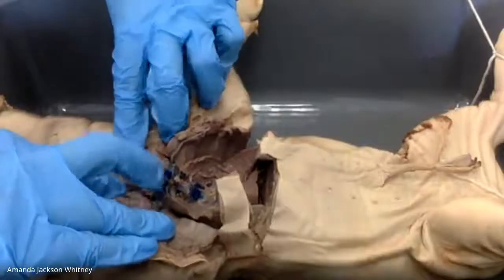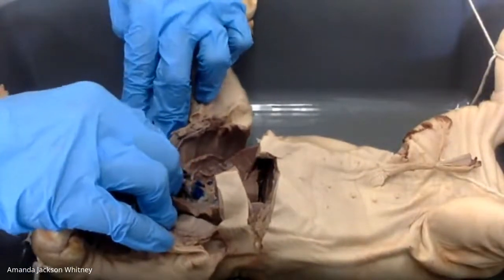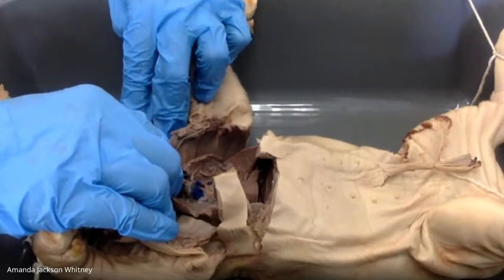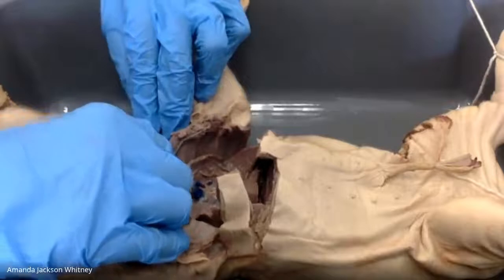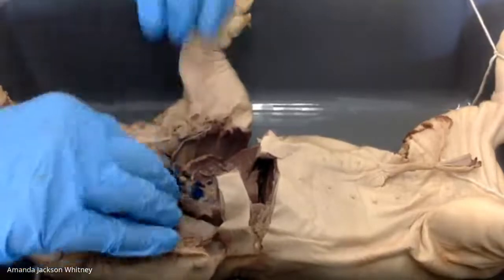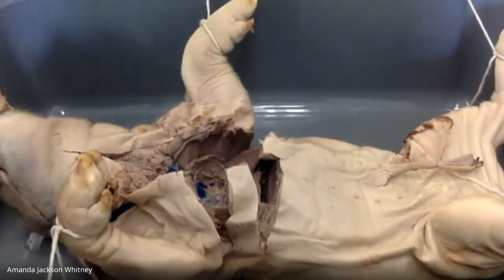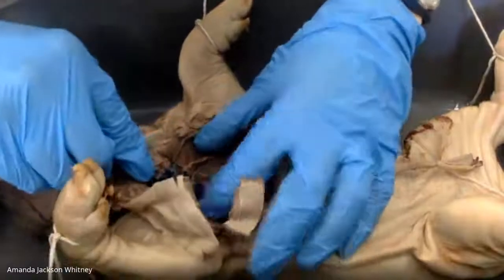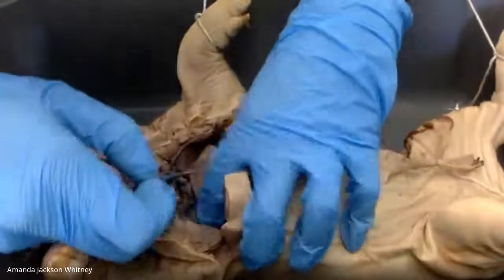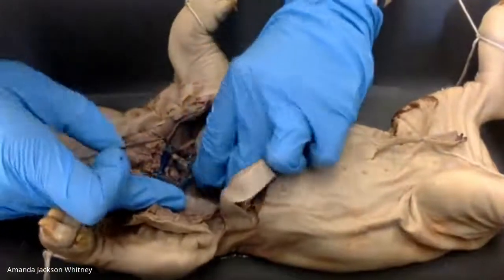All right, I'm going to bring this back. What is this valve? It's up in front of the diaphragm. That is actually the inferior vena cava, bringing blood back up. Yes, isn't that cool? All righty. So I'm going to do a little bit more cutting here. We'll get our lungs out. I already cut through my trachea, which I didn't necessarily mean to do, but I did. Oopsie.